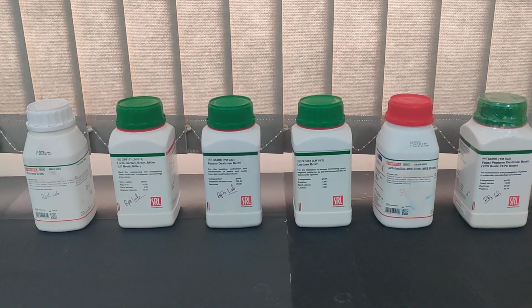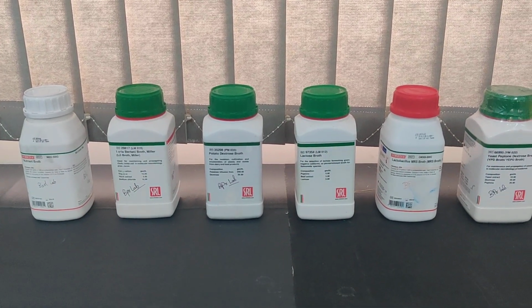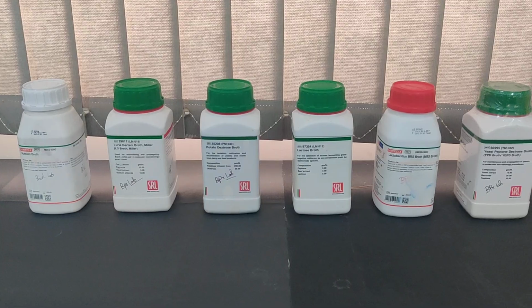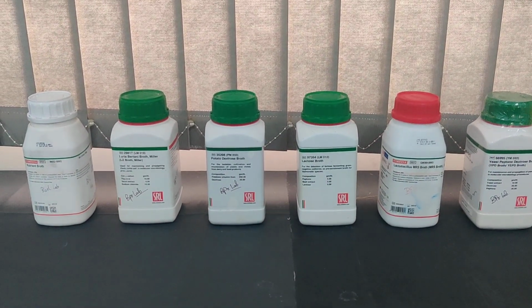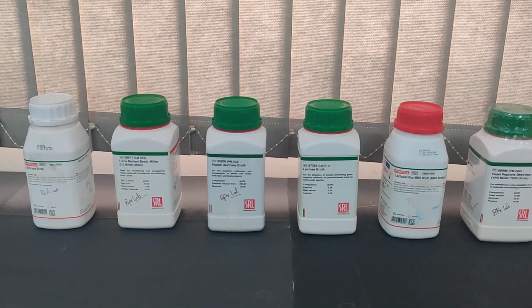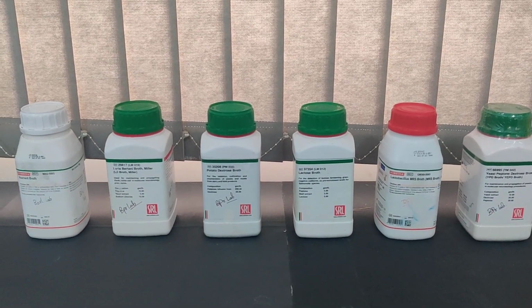So the images and video that I am showing here cover the different forms of growth media that can be used for both bacterial and fungal cultures. We will go one by one, and I will also show you how the medium broths look before preparing the medium, what their texture is, everything in detail. Today we are going to see only the liquid culture medium, not the solid culture medium, but I will show the different broths individually.